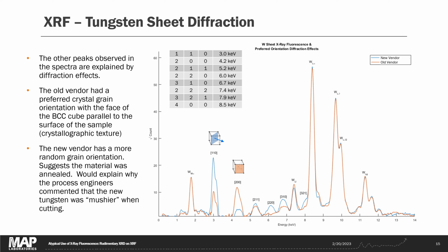I just find this to be really fun, to use instruments in a strange way, and here we're using something that would normally be a sampling artifact that you don't want in your data to piece out interesting information about the specimen. To me, it's interesting in the same way that all those laser diffraction and interference experiments we did in physics were good fun. I mean, sometimes it's nice to have validation that physics works.